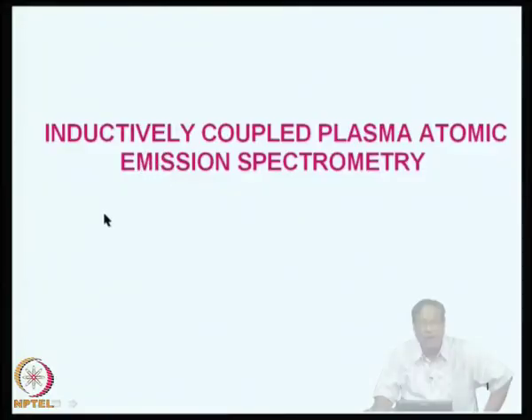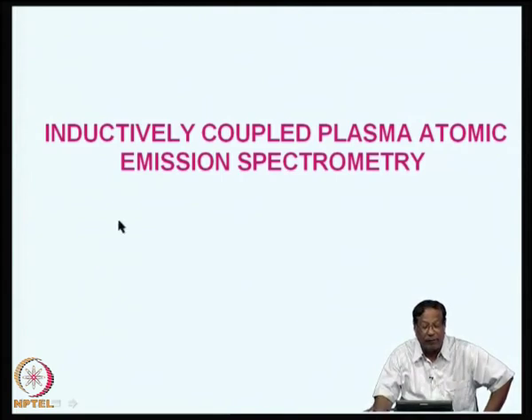Today we will continue our discussions on plasma emission spectrometry, atomic emission spectrometry. I want to concentrate on inductively coupled plasma atomic emission spectrometry. In short form, it is known as ICP AES.